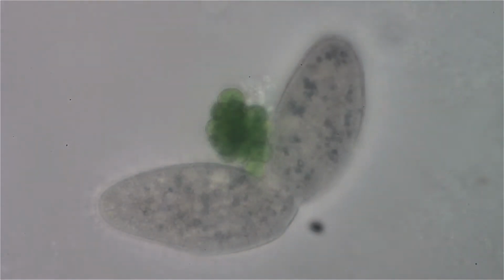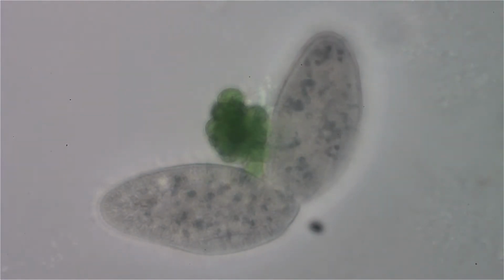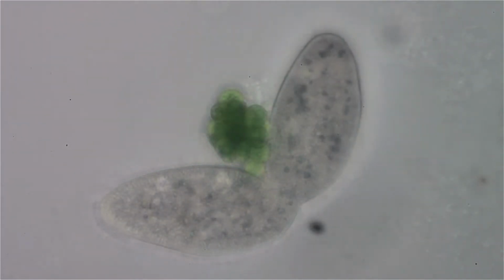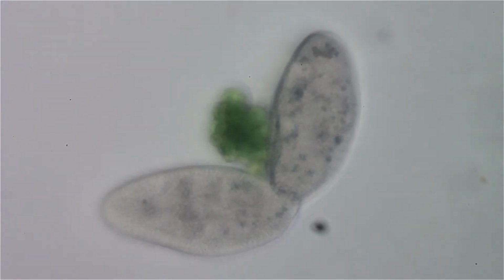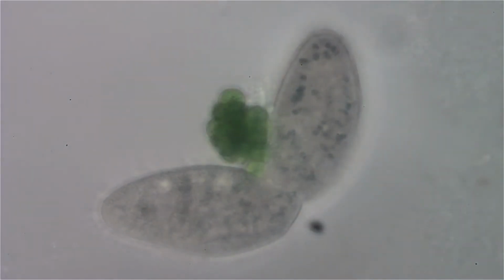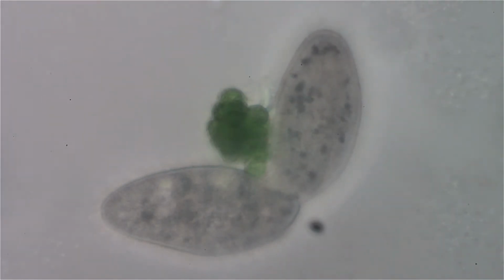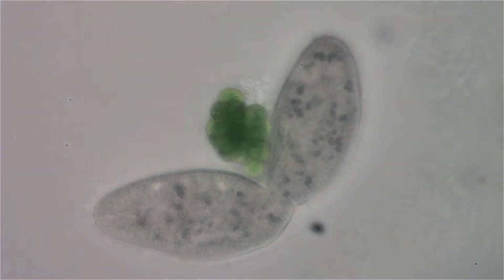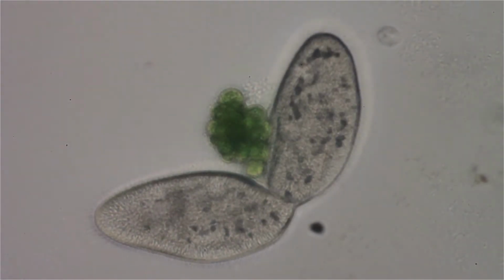And here's another interesting side effect. I'm using a Nikon Fluophot scope with an actual Nikon Fluophot phase contrast condenser under the stage, and you see how we're blurred and out of focus here. It's in the best focus you can get by twirling the fine focus, but as you see here, contrast is getting better, and it'll come into focus better as it goes along. What I'm doing is lowering the condenser under the stage, adjusting it downward further away from the bottom of the slide.